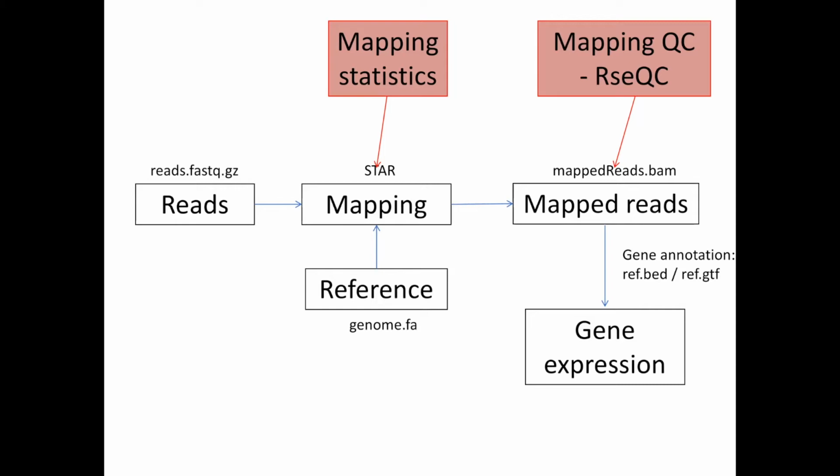And then once they are done, by using gene annotations, you can ask questions like, are the reads mapped to the exons as I think, or are they mapped in other parts of the genome? Do we find the correct intron-exon junctions as we expect, or do we find a lot of other stuff? Other things like that we can ask by using annotation and the mapped reads.